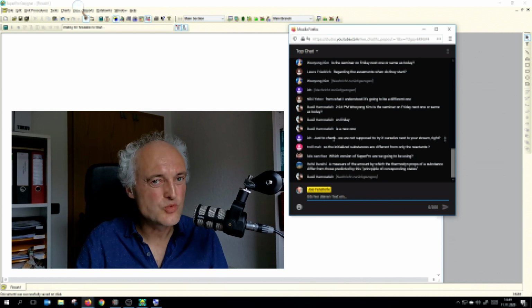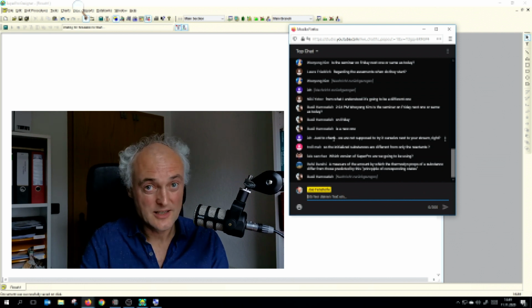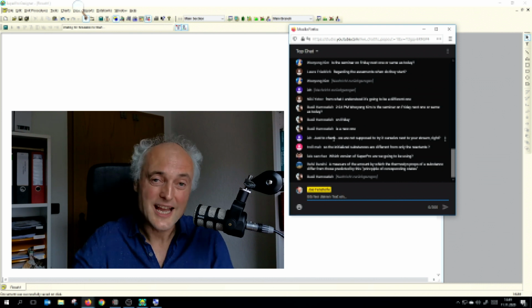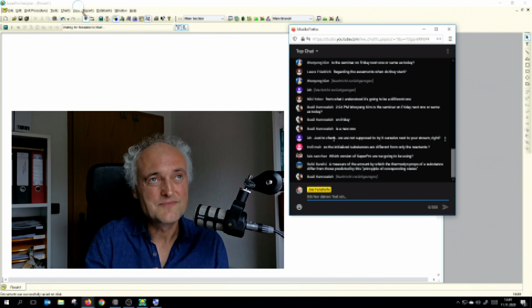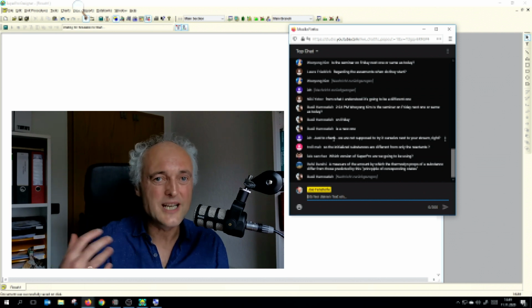You can do it, but it will be hard. What I would recommend is to watch the stream now, and directly after I'm ready with the stream, do it yourself. Because if you do that really in parallel, sometimes things are too fast and you cannot ask directly, wait a second.